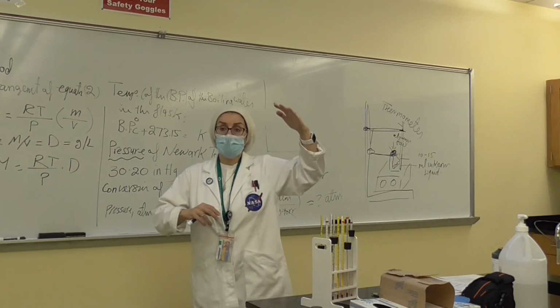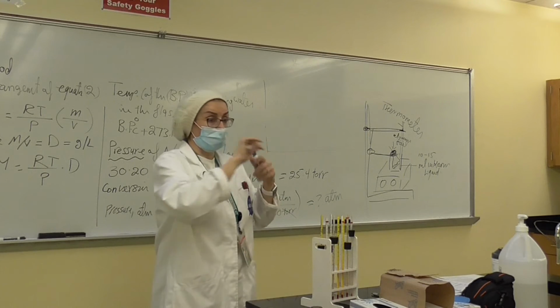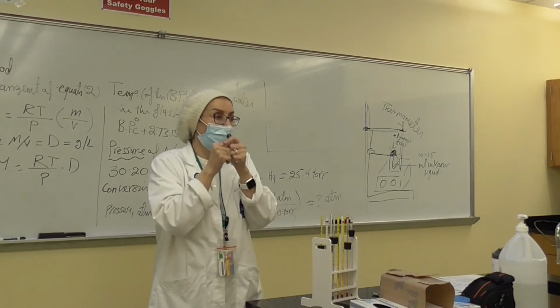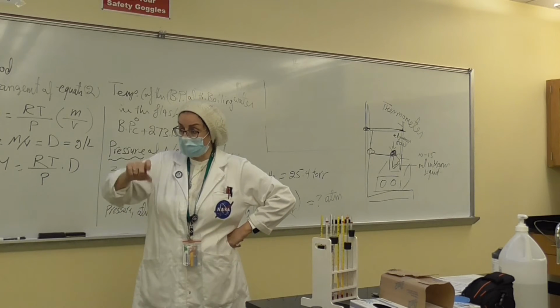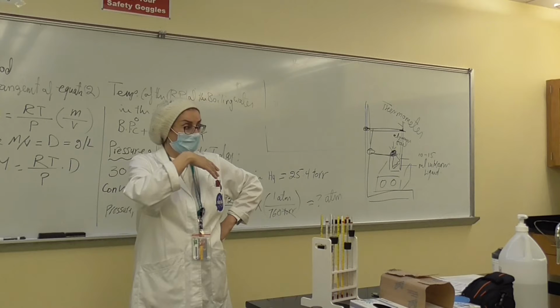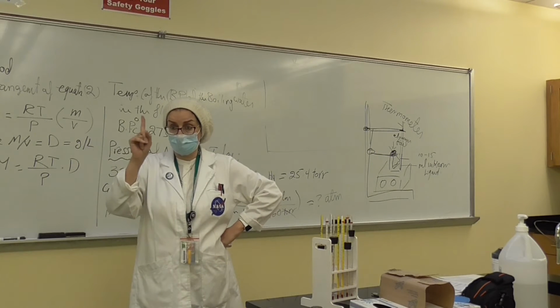Now, the reason why we put the aluminum foil is so we try to get hold of the liquid. But when you heat the air inside the Erlenmeyer flask, we are going to, what? Get rid of all the air, the vapor water, okay?